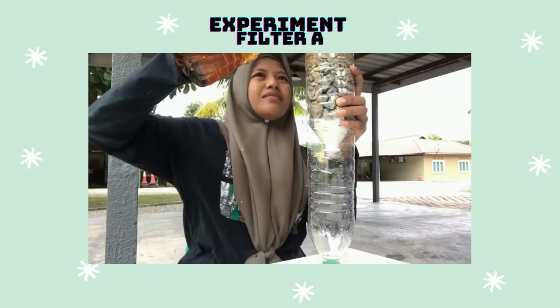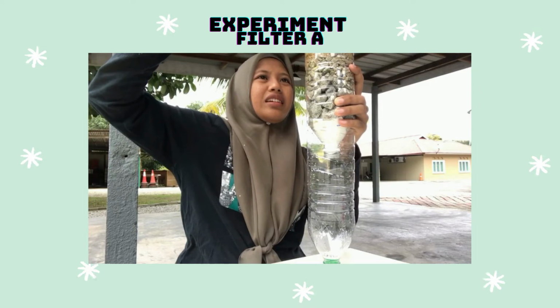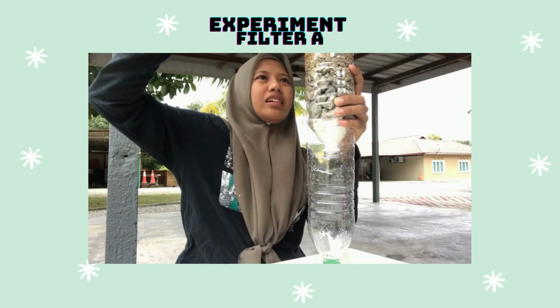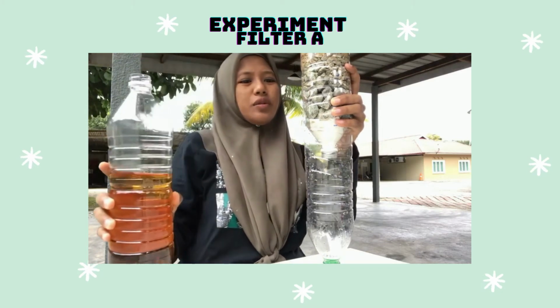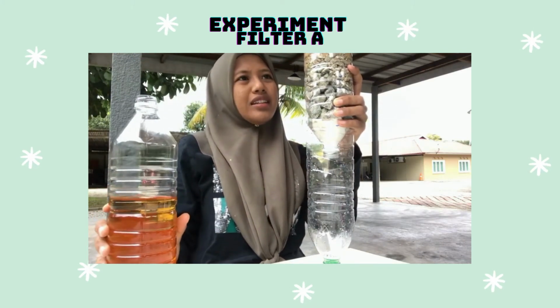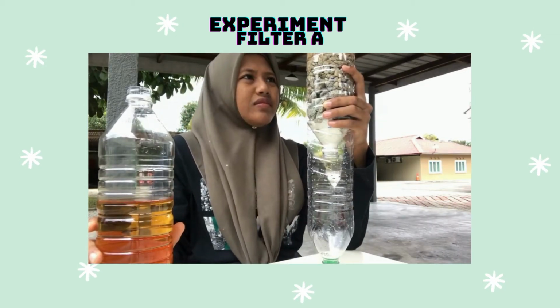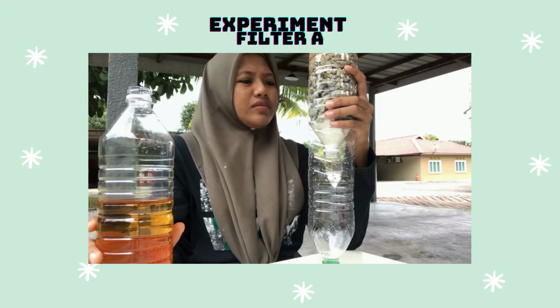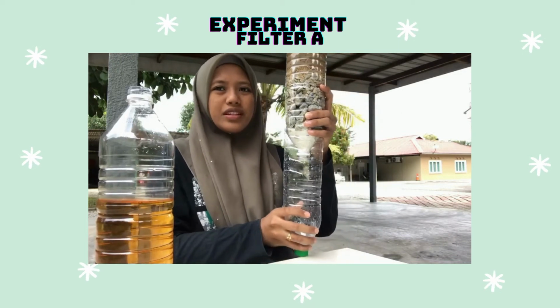This is about 1 liter of tea. Bismillah. Now we will wait until the water drops. Or maybe you will not see the water.